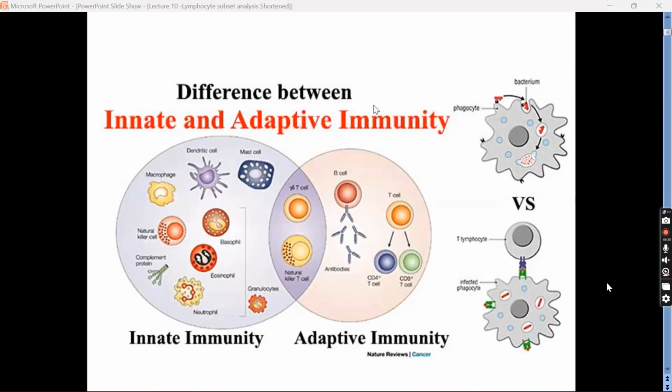When you don't have a good flow cytometrist in the laboratory and you want to do a CD4 count, the company people just create a template with an auto gate. They set a gate and lock it. So when you run the sample, whatever events fall in that preset gate will be counted as the population, and the percentage and the absolute counts will be given. This is okay, but you should have a knowledge of whether it is doing it rightly.